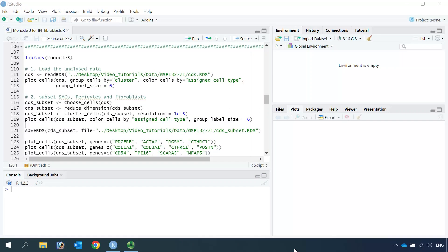Hello everyone, welcome back to my video tutorial for single-cell RNA and DNA data analysis. In my previous video, we performed single-cell RNA sequencing data analysis using Monocle3 and we saved the CDS file. Today we just need to read the CDS file into R, then we can continue our trajectory analysis.